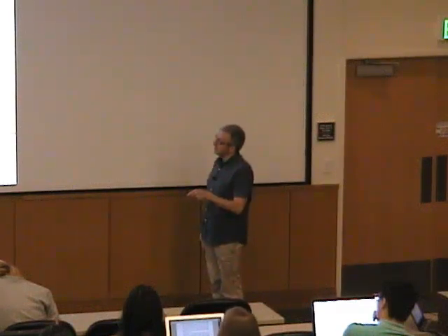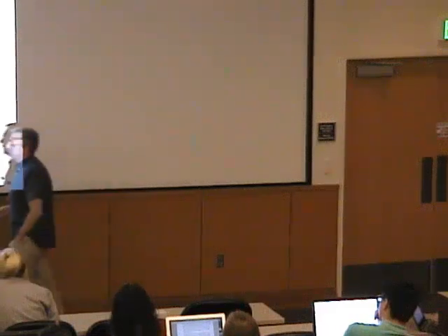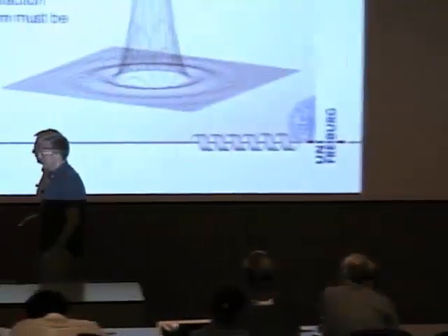While everything that we want to know, which is the contents of the unit cell, is encoded in the intensities of these diffraction maxima. So we need to understand the metrics of the crystal, step one, and then after understanding which reflections HKL, or which indices HKL, to assign, we just go and measure intensities, which means we fit a 2D Gaussian and integrate that. Okay, and that's why the first step is called indexing, and the second step is called integration. So that's what we do there.